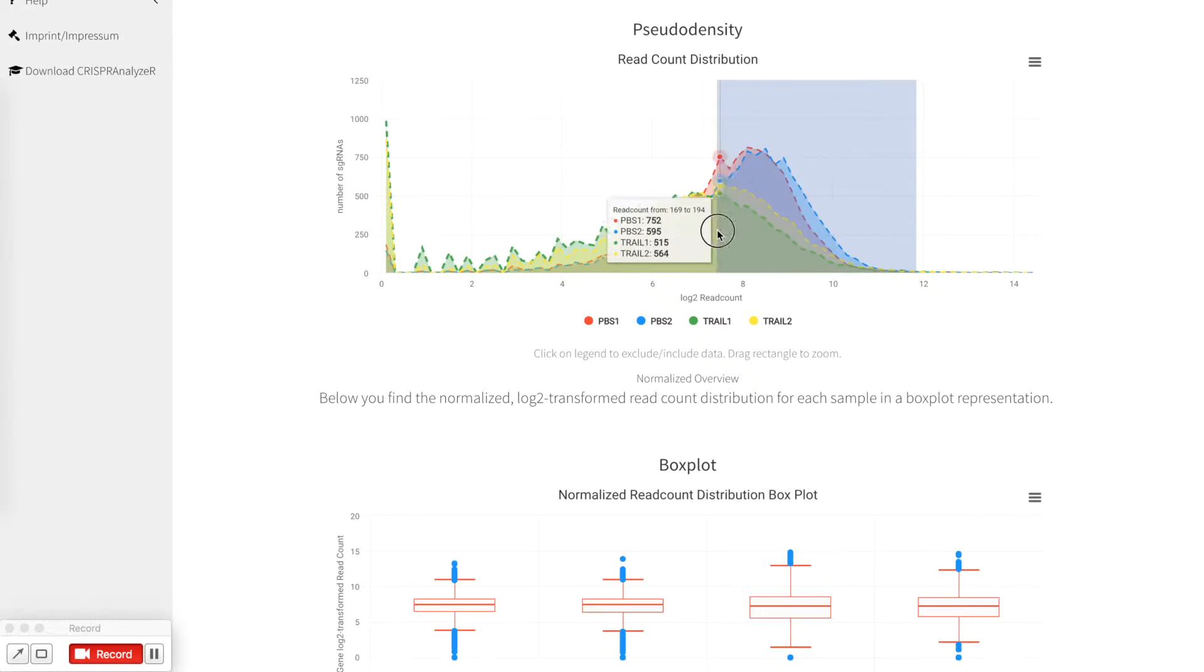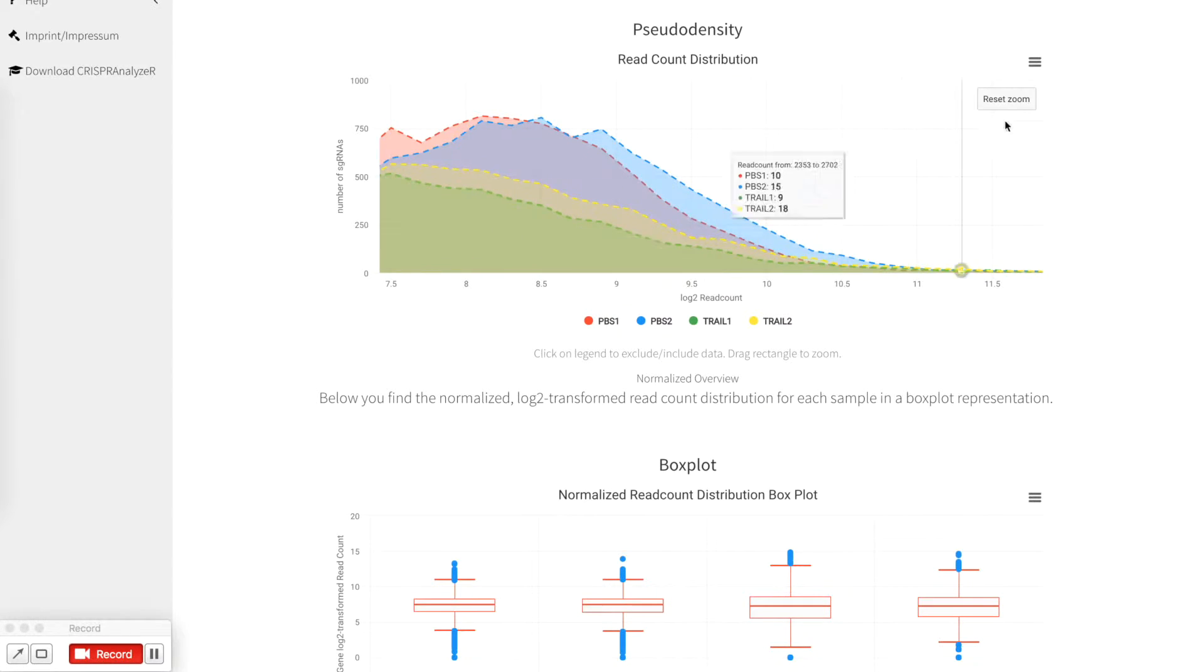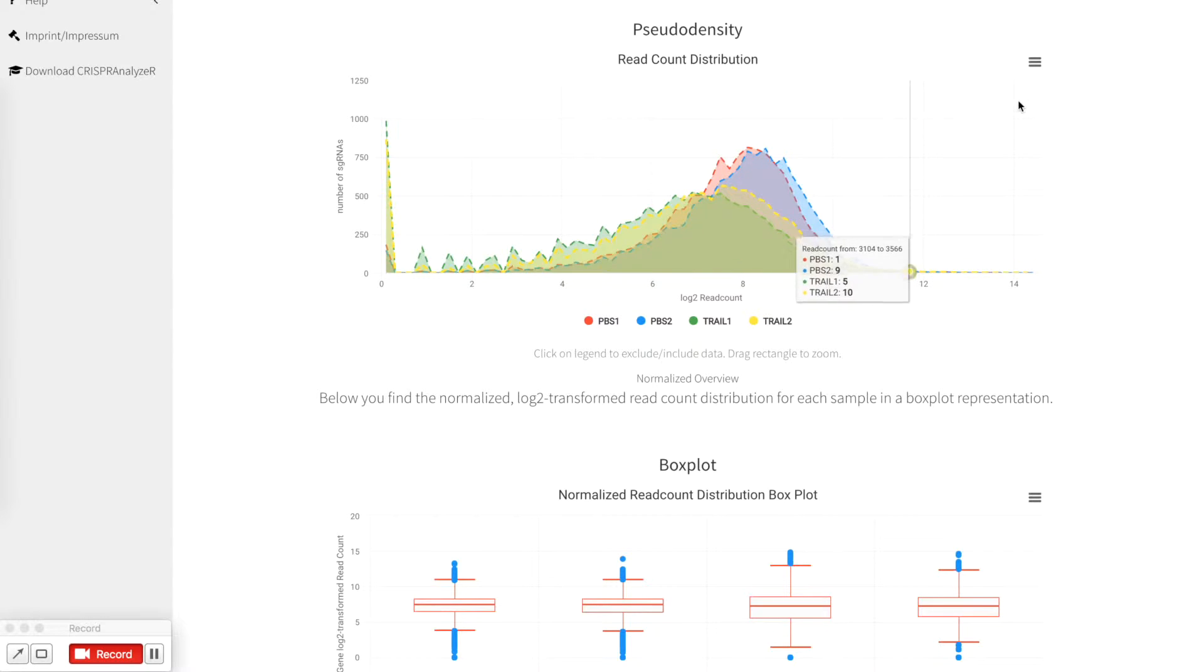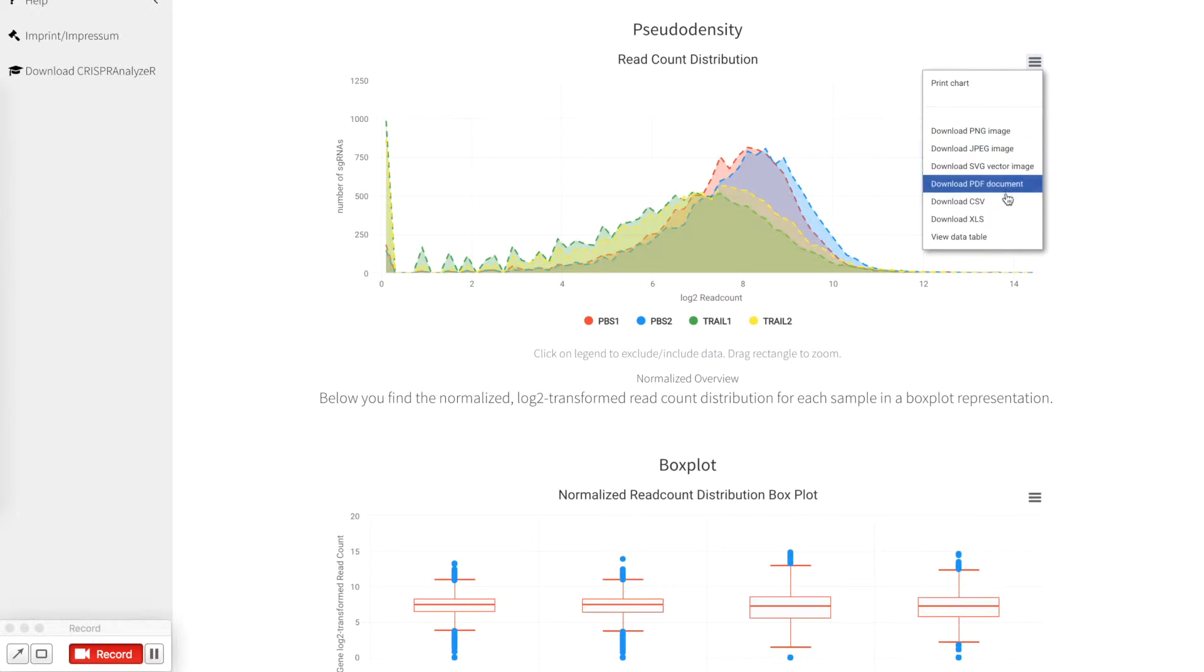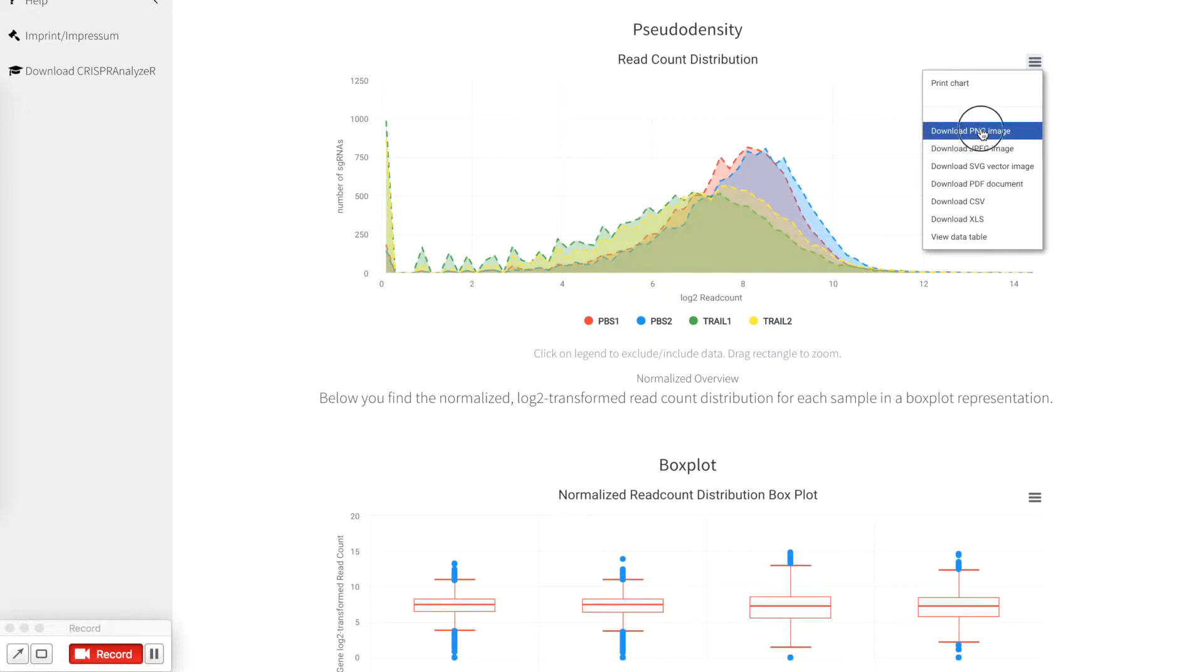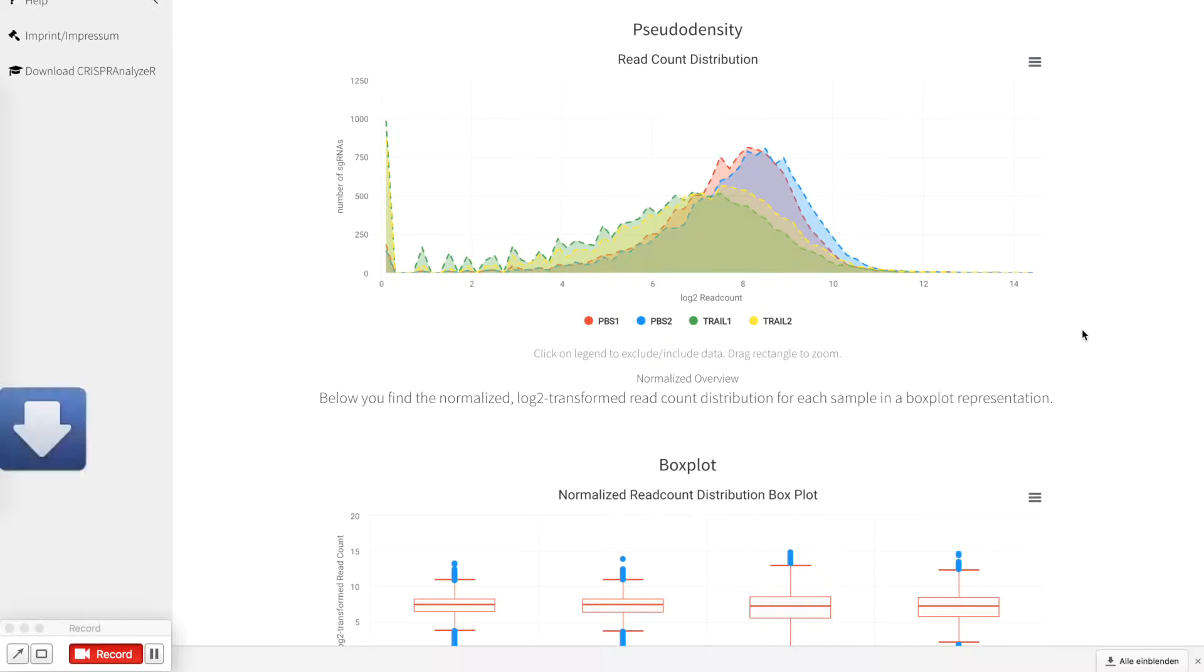You can also zoom in, go back or download the plot as a png file, jpeg, pdf or whatever you like. I like to download it as a png file so I click on it and the data will be downloaded to your folder.